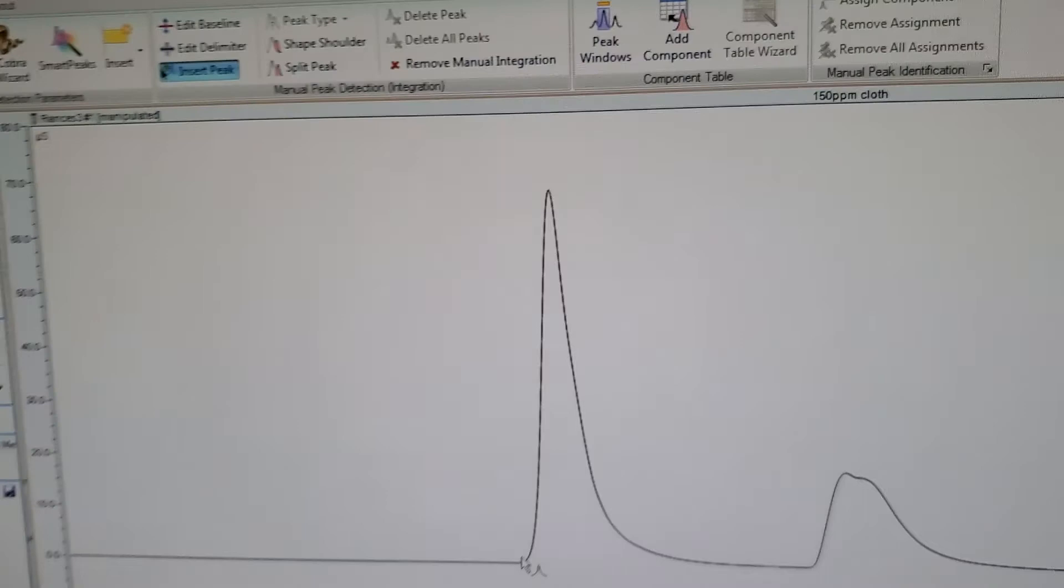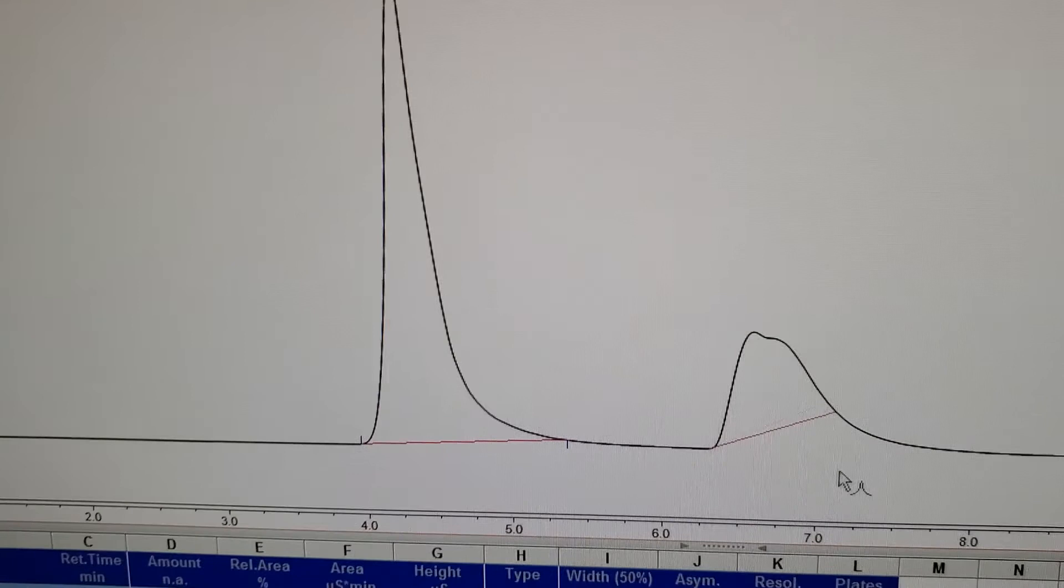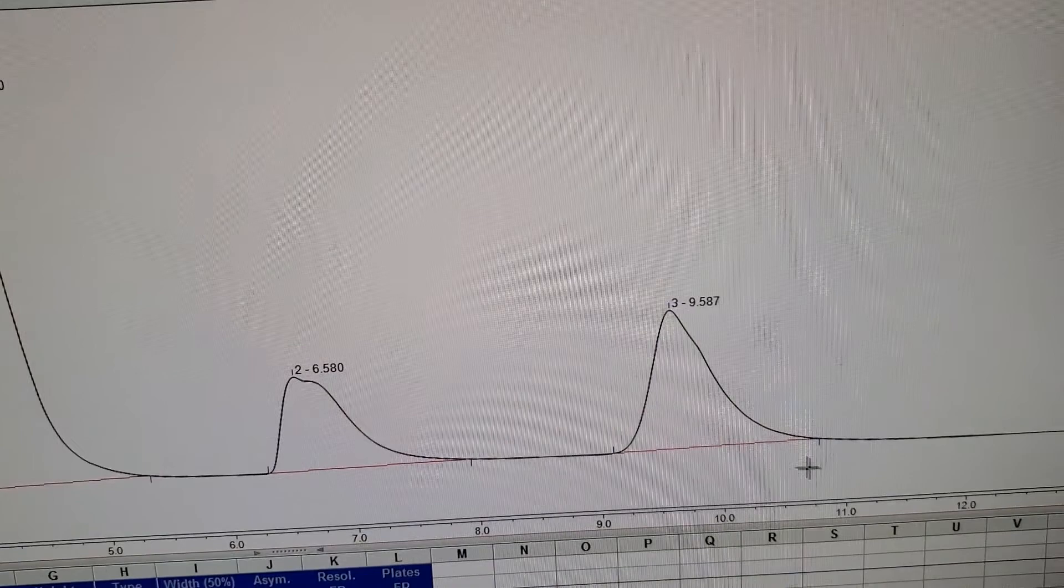You create the baseline under each peak, and it integrates between that. All the results are down in this bottom section.